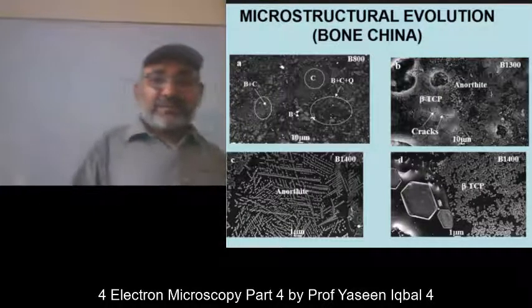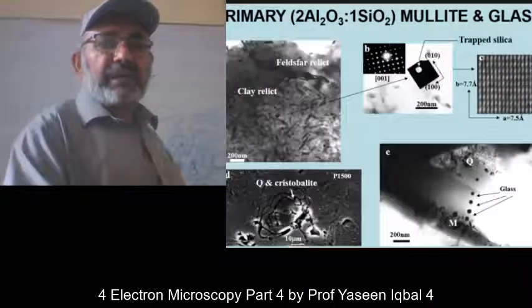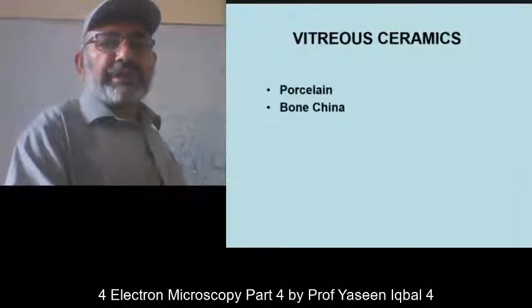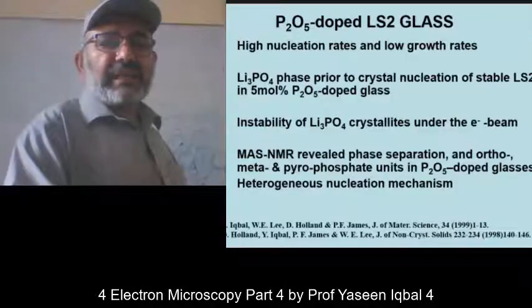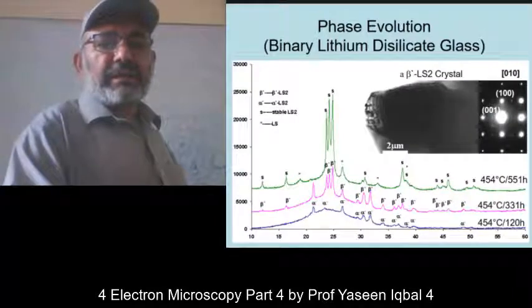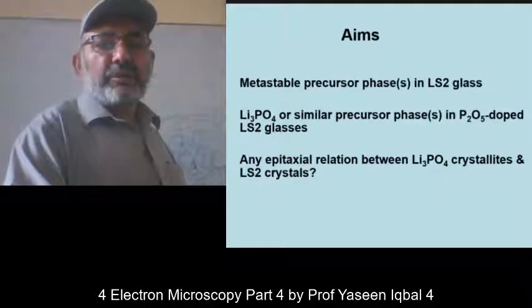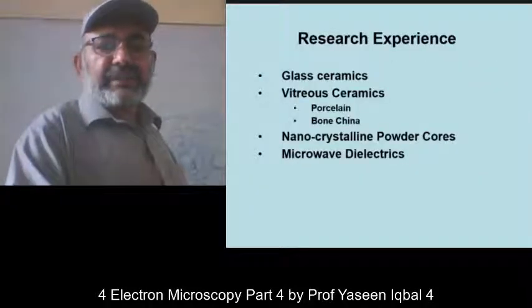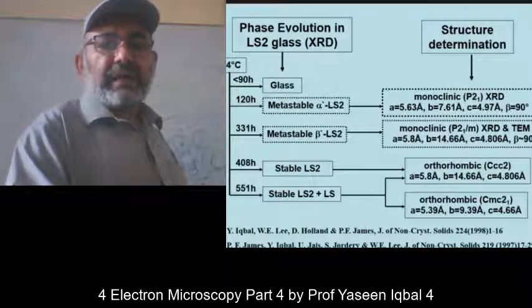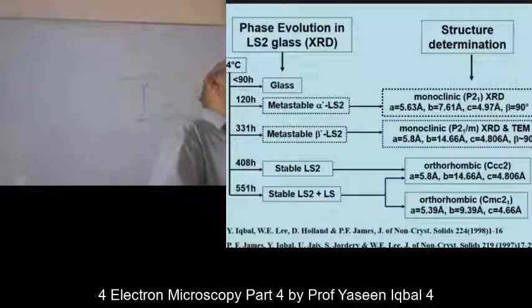So when I did that scanning electron microscopy and I knew about the general morphology of these crystals, then I decided that okay, this is this particular material and it looks like that. And at the same time, I did XRD of these samples and found which phases are forming after different heat treatments.